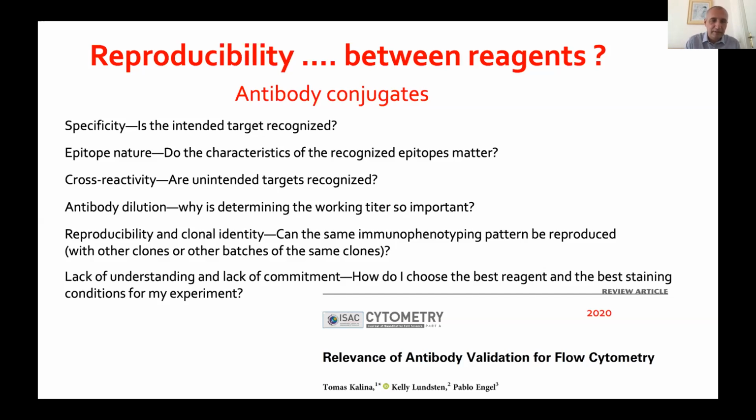The cross-reactivity is the issue where also unintended targets are recognized, and antibody dilution, sometimes called titration, is key for the right interpretation of the result.